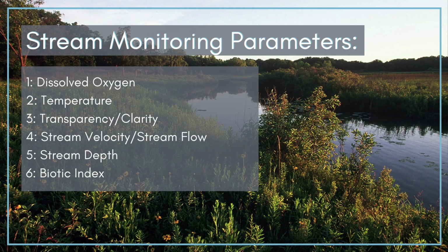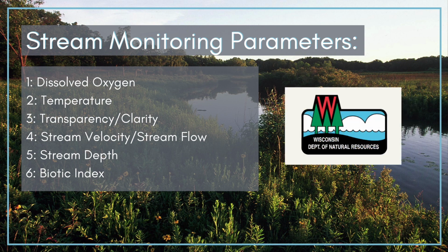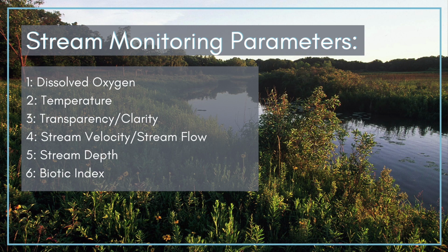There are 6 different tests we conduct while stream monitoring. These parameters were created by the Water Action Volunteers in collaboration with the Wisconsin Department of Natural Resources. Throughout this video, I will go over how and why we measure each parameter.